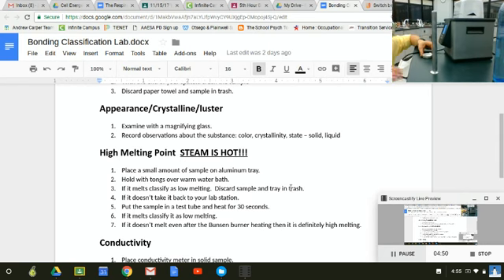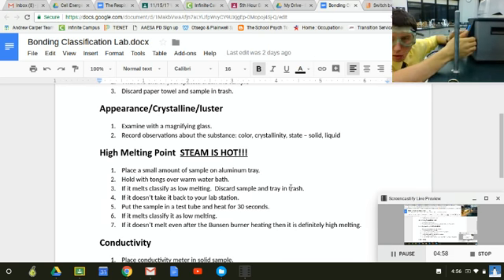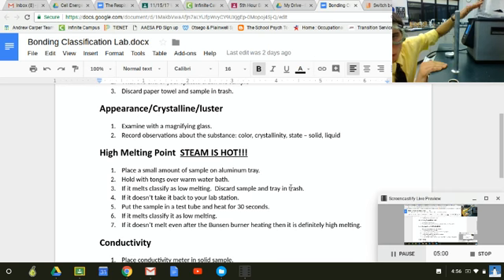And at the hot water bath, this is really warm. As a matter of fact, it's hot enough that it can scald you. So the outside of this is actually going to be warm. You don't want to touch it. And then when you open the lid, the water is near boiling. This water would burn you. Okay, so be careful. We have our 4 steps at your data station.